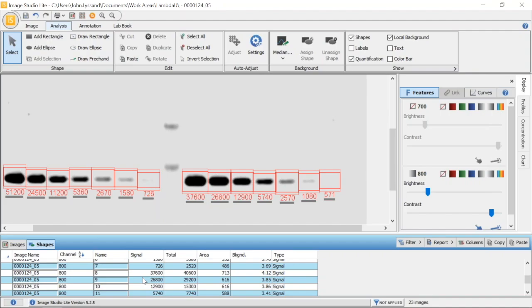The signal value equals our total intensity minus the area size times the background.